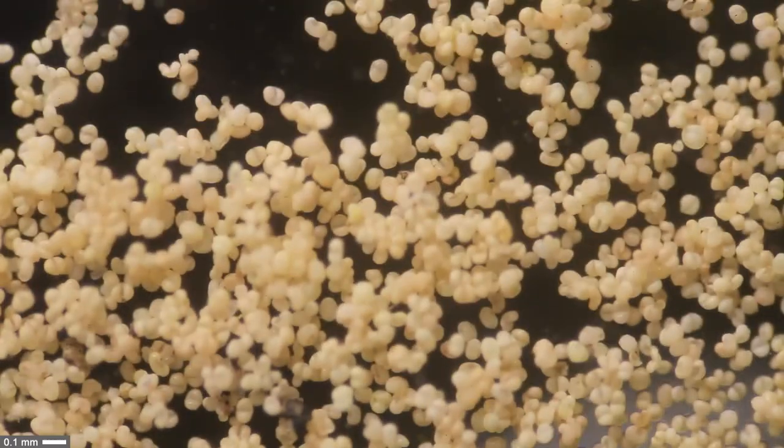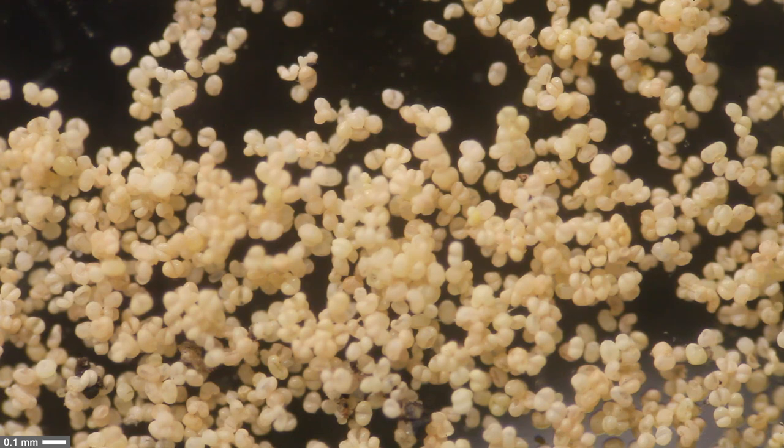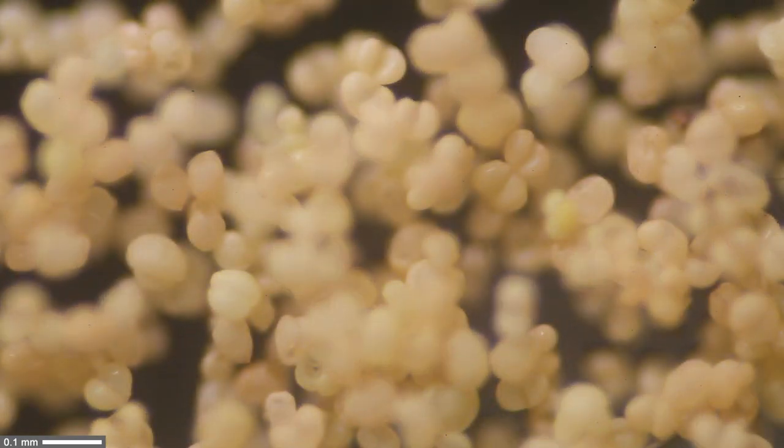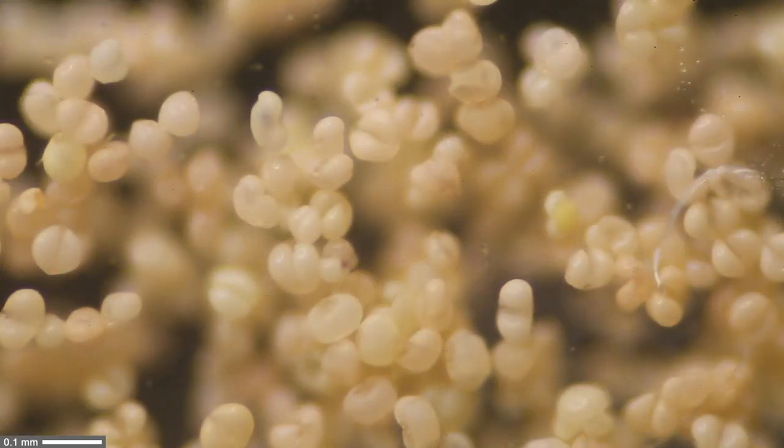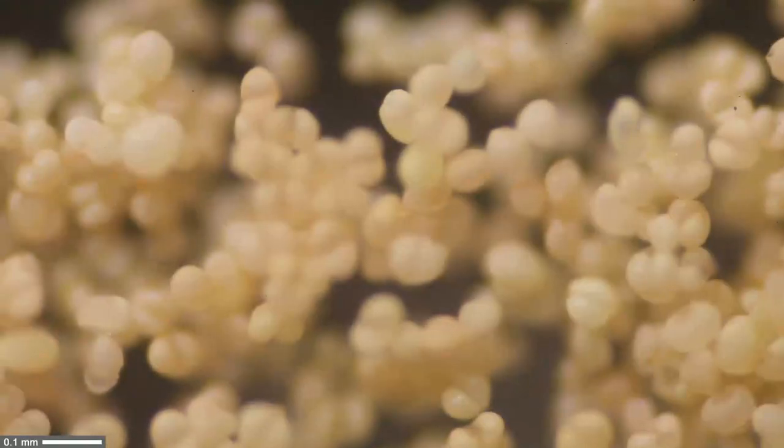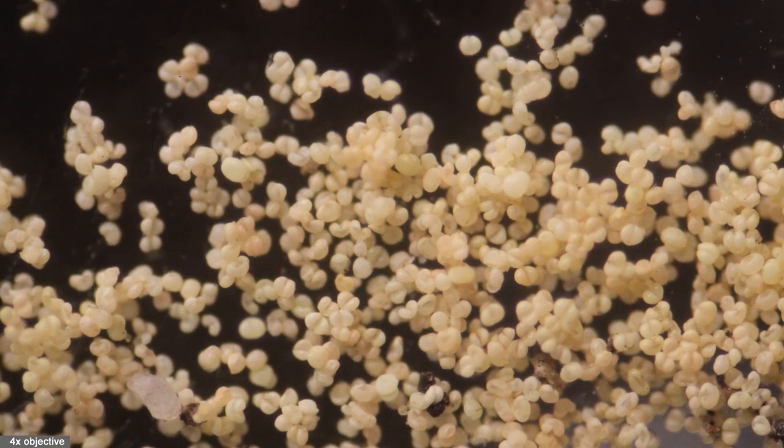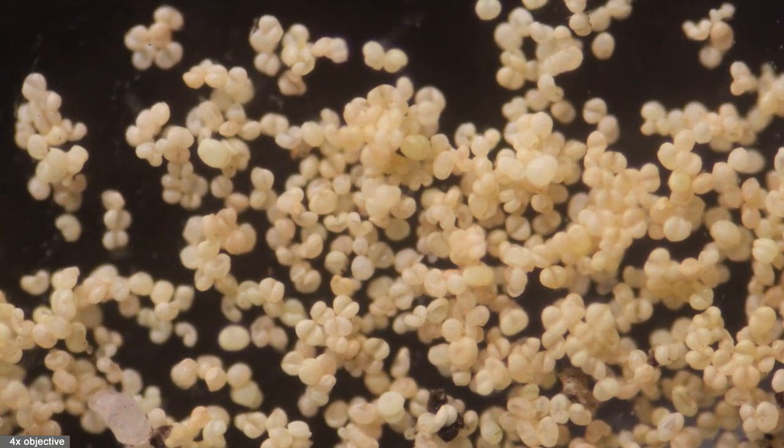That is also one of the reasons why I actually used the spacer ring, because I wanted to make sure that the pollen aggregates stay as they are naturally. You also use these spacer rings if you, for example, want to use larger water organisms like water fleas and so on. You do not want them to become squashed by the cover glass, so that's why you also use spacer rings.